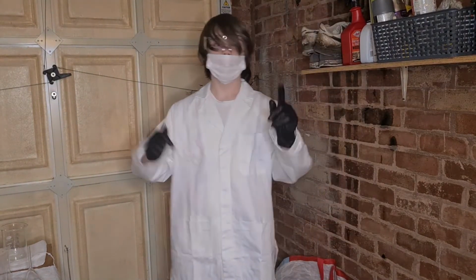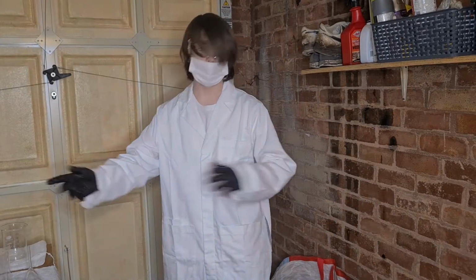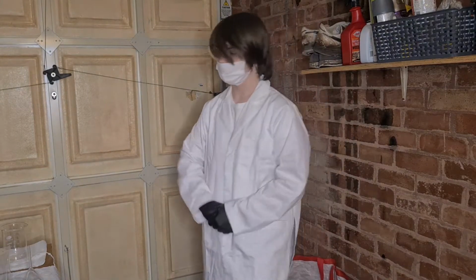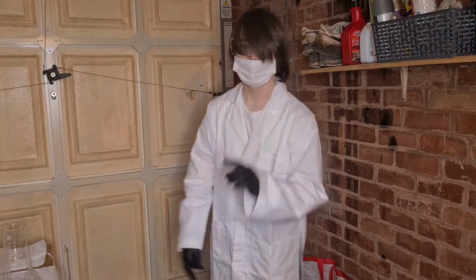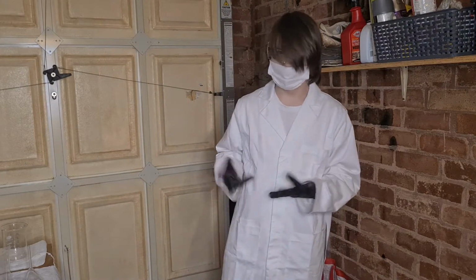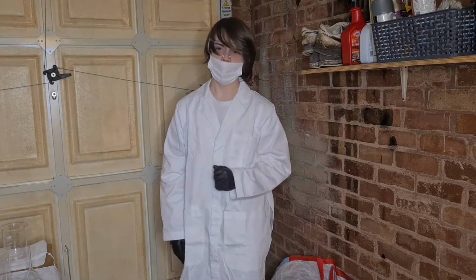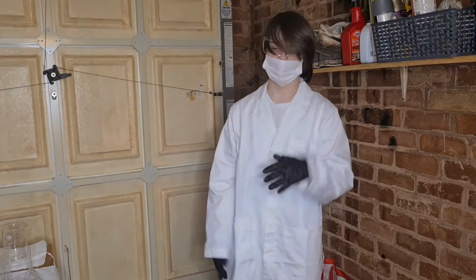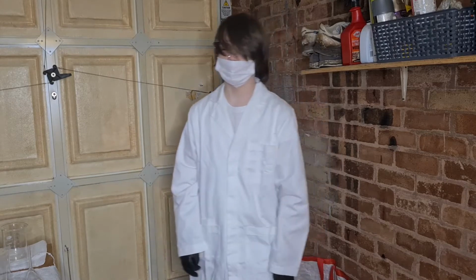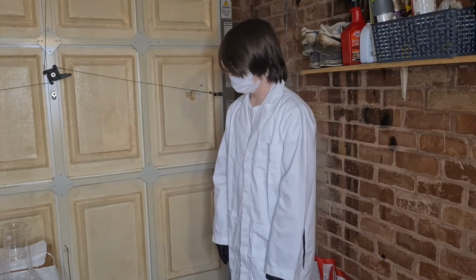So, you may have noticed I mentioned the word crystal. What am I making? Well, sodium chloride. I know. I'm stepping it up a notch this time. And while I can't really use that in a cup of tea, because one, it would taste frankly quite terrible, and two, it's not food grade acid that I'm using, so it would probably kill me anyway.